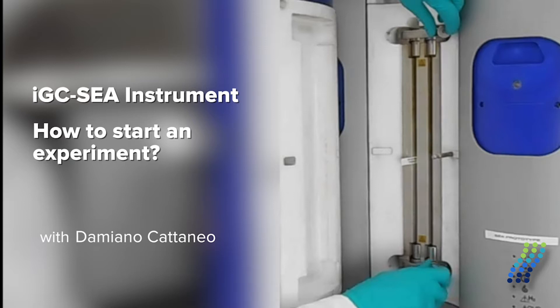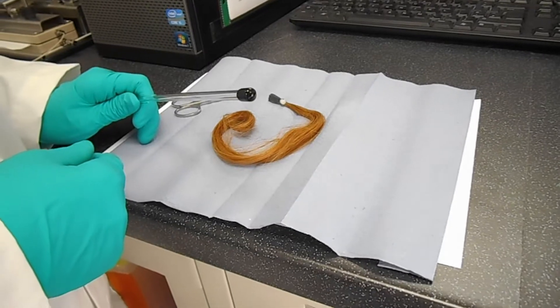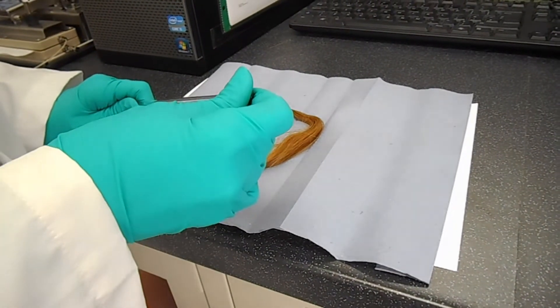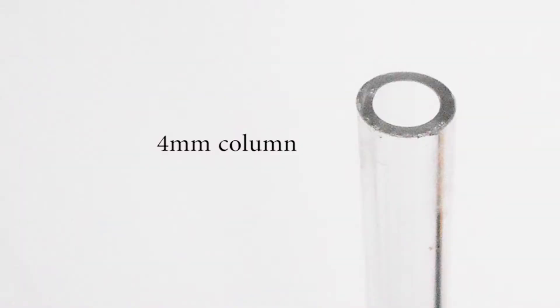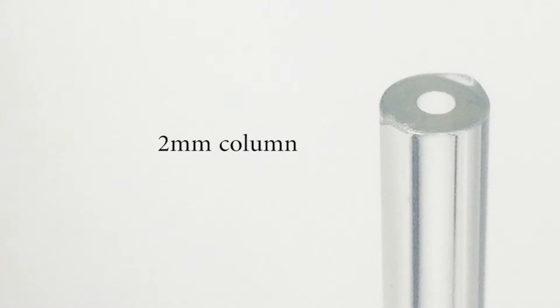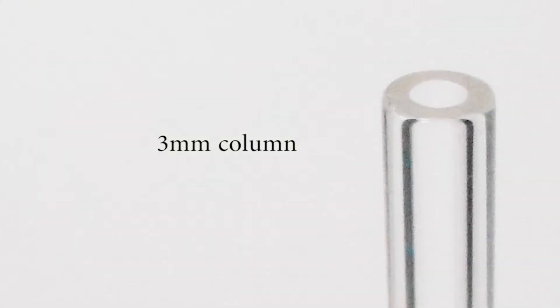So what we are doing today as an experiment is run the characterization of a hair sample. We are using long hair fiber and in this case we are using a four millimeter column. We also provide two and three millimeter columns for different types of samples but usually for hair samples the four millimeter column is ideal.